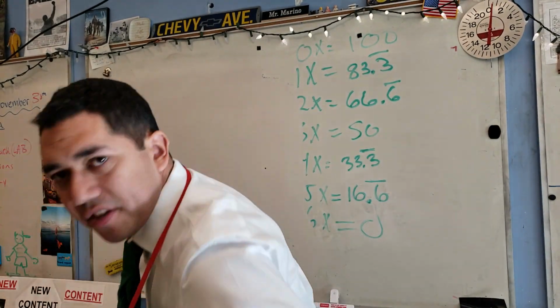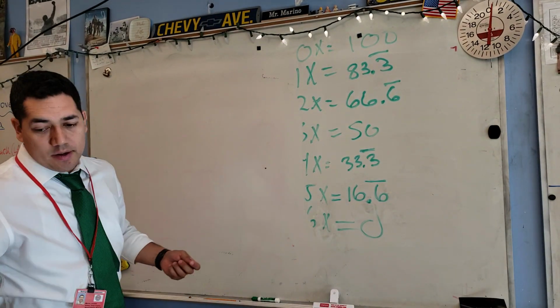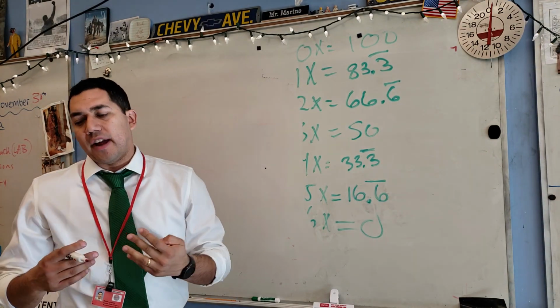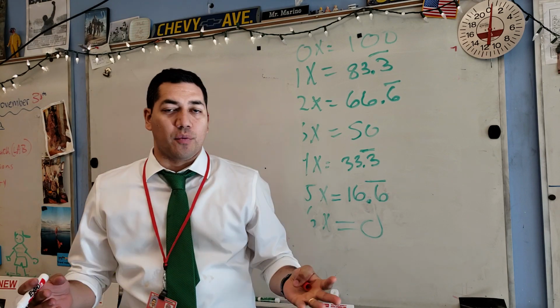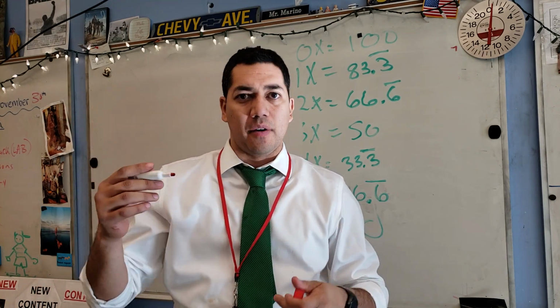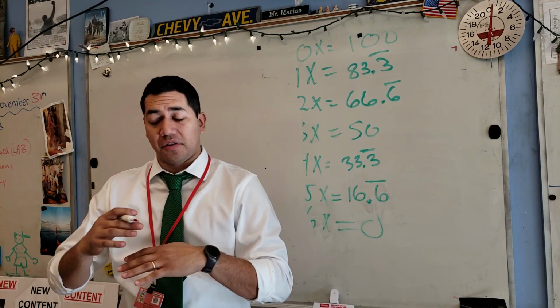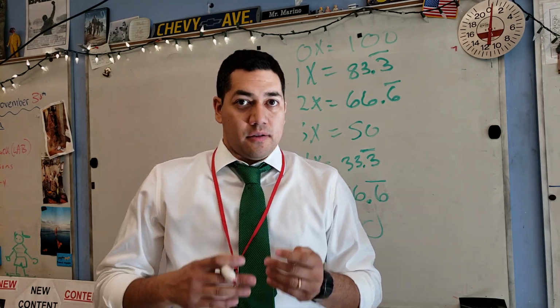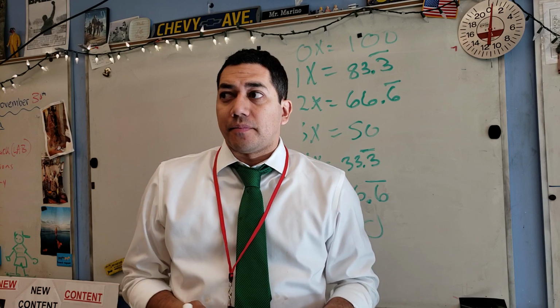Okay, for the second part of the lab, where do we leave off? After you have calculated the densities of all of the liquids, you then categorize them, put them in order from the least dense to the most dense. Now it's time to begin the experiment. So this is part of your procedure, actually.